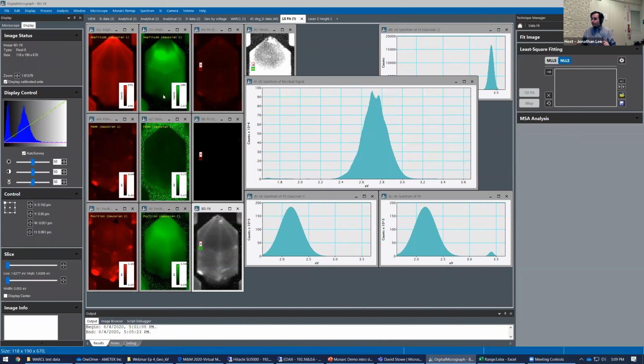So I'm going to move to, well, I think I don't have time to move to a new specimen, but I do have some data from it that I can demonstrate for you. So the other parameter that you would need to tune as a user is the accelerating voltage. And accelerating voltage is a big deal in dealing with CL because it controls both your resolution and the number of electron hole pairs that you generate. So current and voltage can both generate more pairs, but the voltage is typically controlling the current.